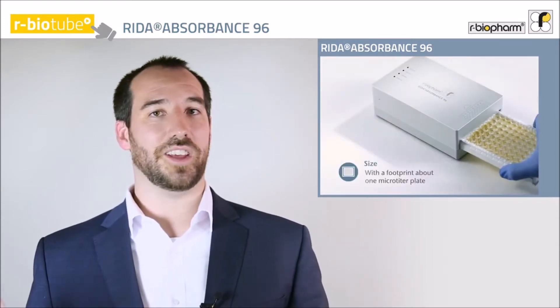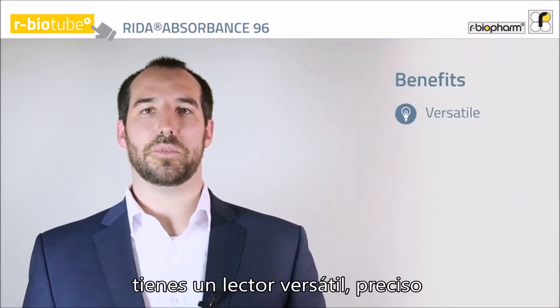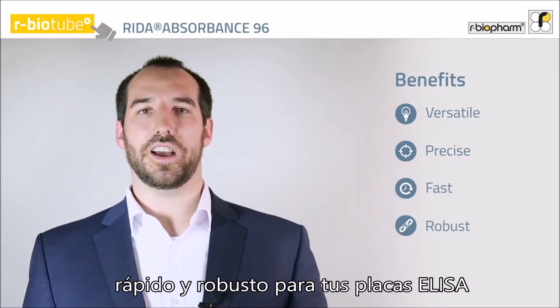You see, size doesn't matter. With a footprint of just about one microtiter plate, you have a versatile, precise, fast, and robust reader for your ELISA plates.